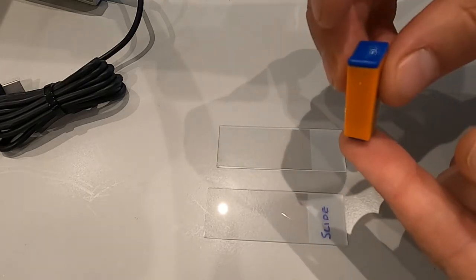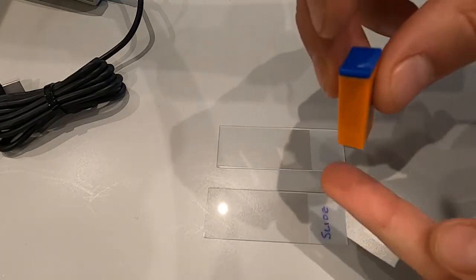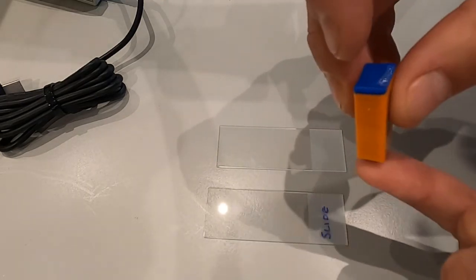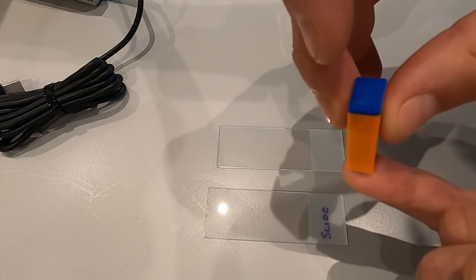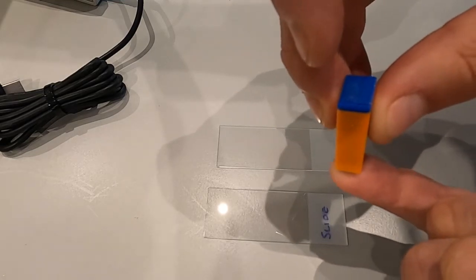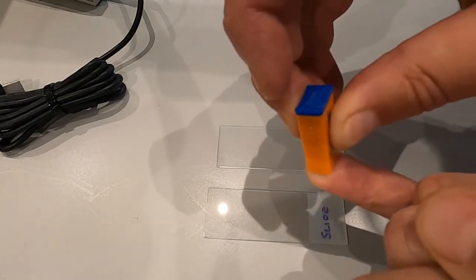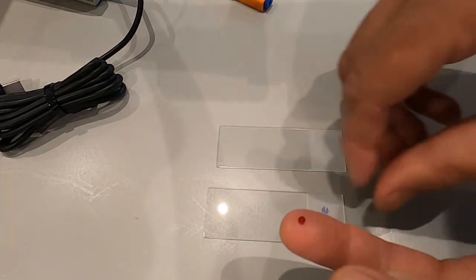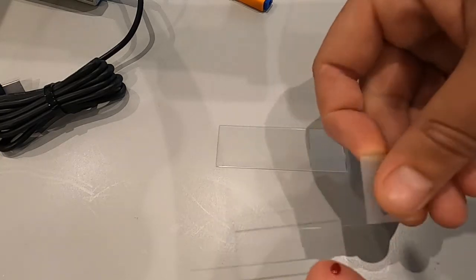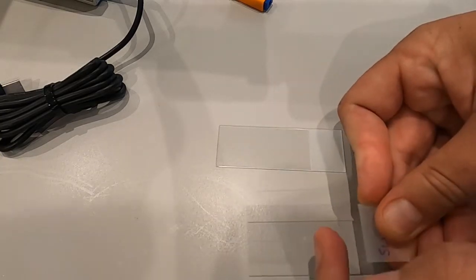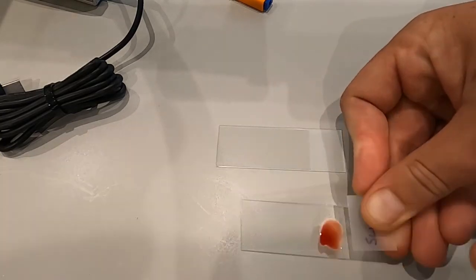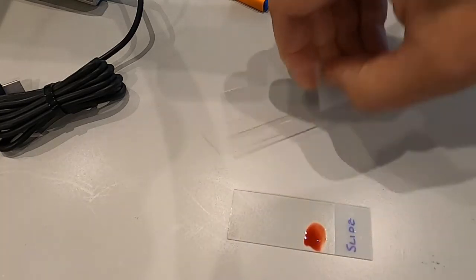You then place it on your finger and push down. That puts a tiny needle through, giving you a drop of blood. You put that on top of your slide.